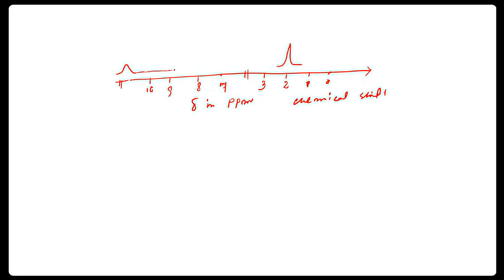So let's say this is the NMR spectrum. I say spectrum because this is singular. Now, when you run the software, you will understand that we have to integrate. If we integrate, this value is going to be 1 and this value is going to be 3.